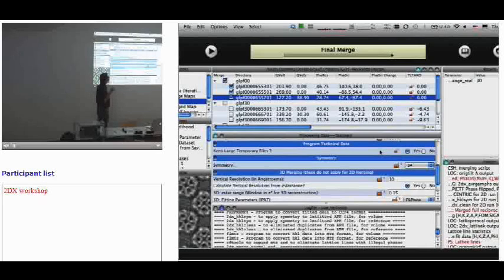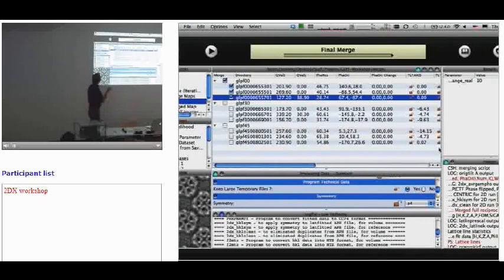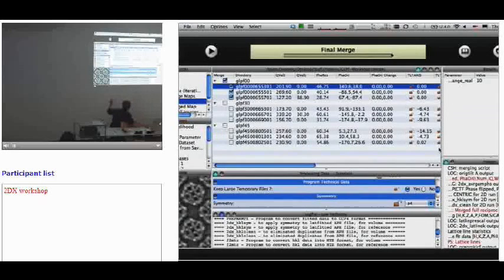Here is a kind of Excel sheet-like table where for every image that you have in your project, you have a line. Those are the file names or directory names, and here are the phase residuals and phase origins that are currently there, and the tilt axis and tilt angle values. And we group them together by tilt range. So this is non-tilted, 30-degree tilted, and 45-degree tilted. So I have 6 tilted and 3 non-tilted images here. And then you can step over these by just clicking on them or stepping over them, and you see here this preview.